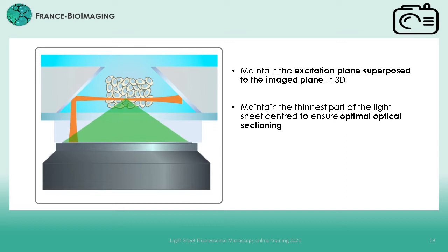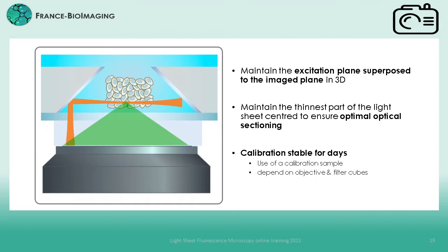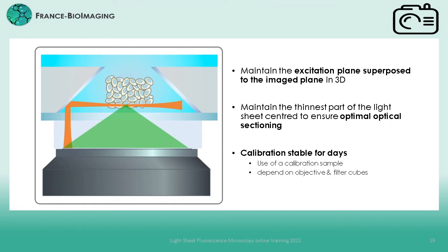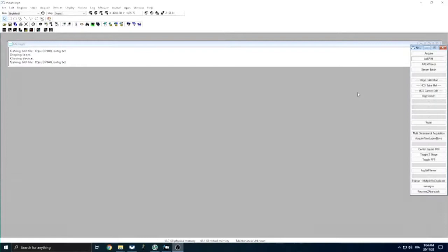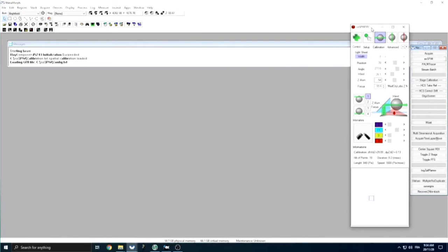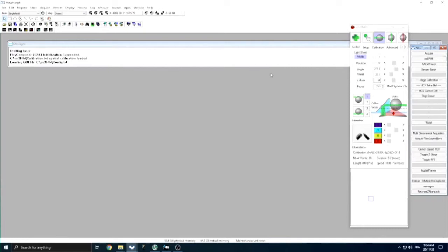This calibration is usually stable for days and can be done either directly on our device containing the sample, or using a calibration sample filled with fluorescent solution in order to better visualize the laser beam and simplify the process. It usually has to be done each time we change the objective or the filter cube. To perform this synchronization, we use a SOSPIN device containing no biological sample but filled with fluorescent solution, here a concentrated fluorescein solution. This sample is simply positioned on our microscope stage on top of the objective.